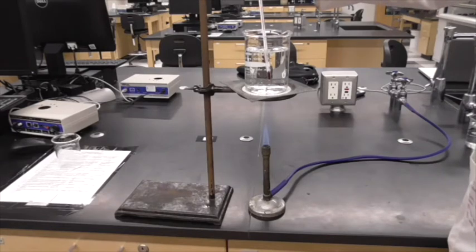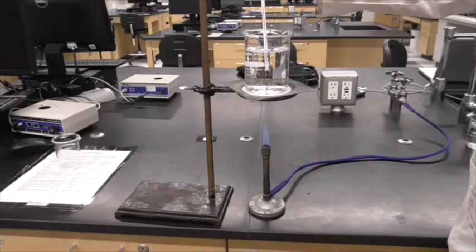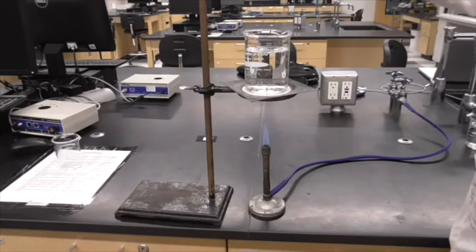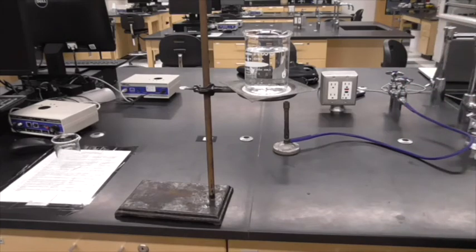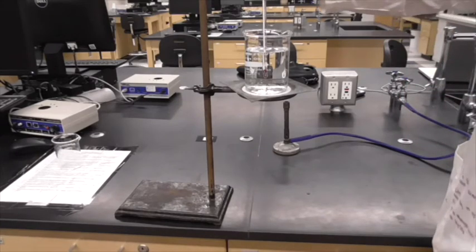We're at 35. 37. 38. I'm going to take the Bunsen burner out to make sure it's going to get to 40.